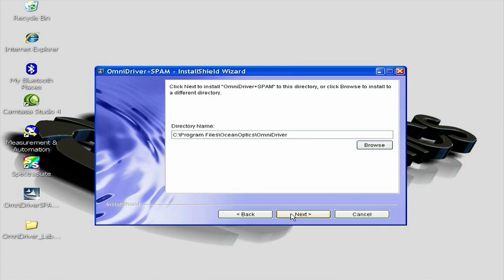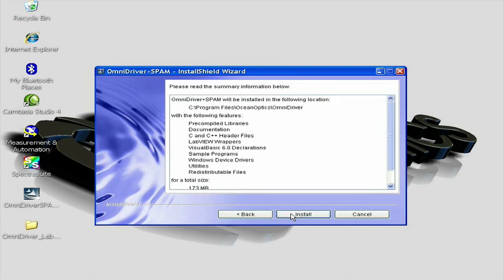This screen shows you the location that the Omni Driver plus SPAM package will be installed. Once you have noted where the files will be installed, click Next.